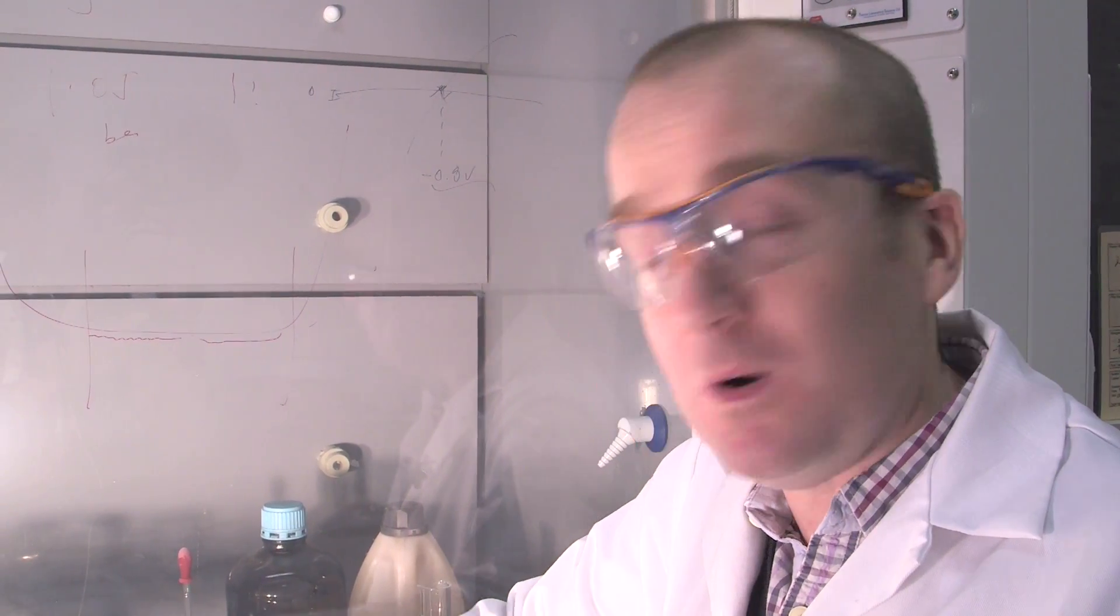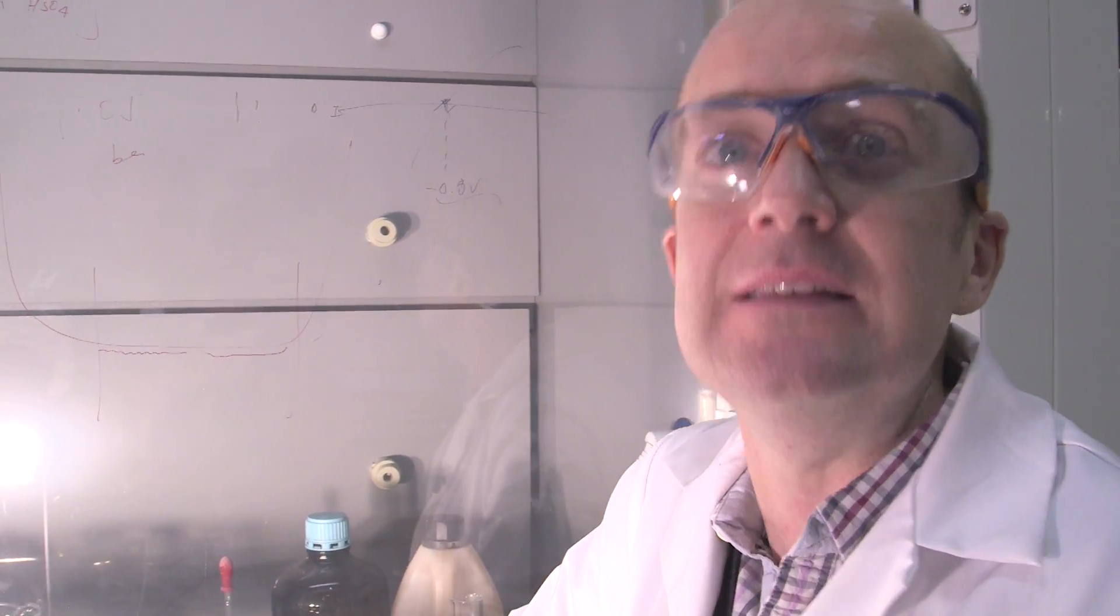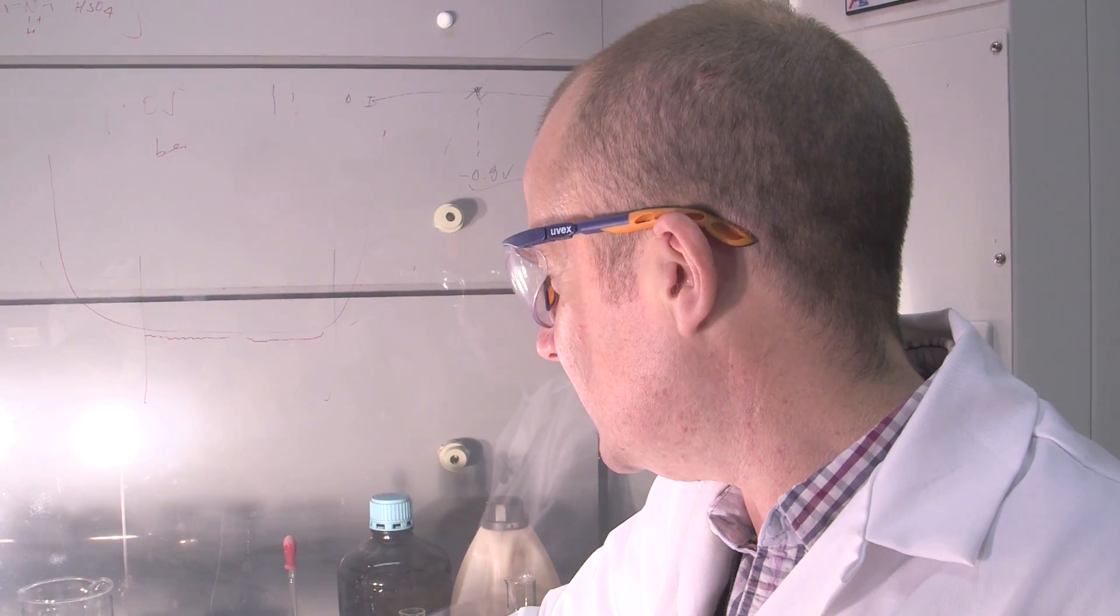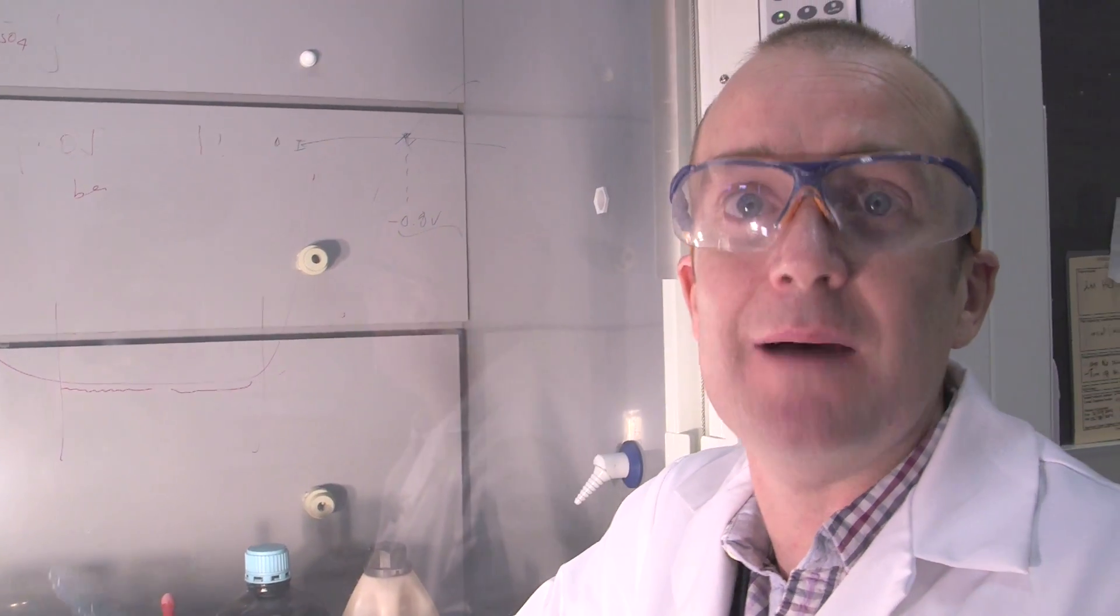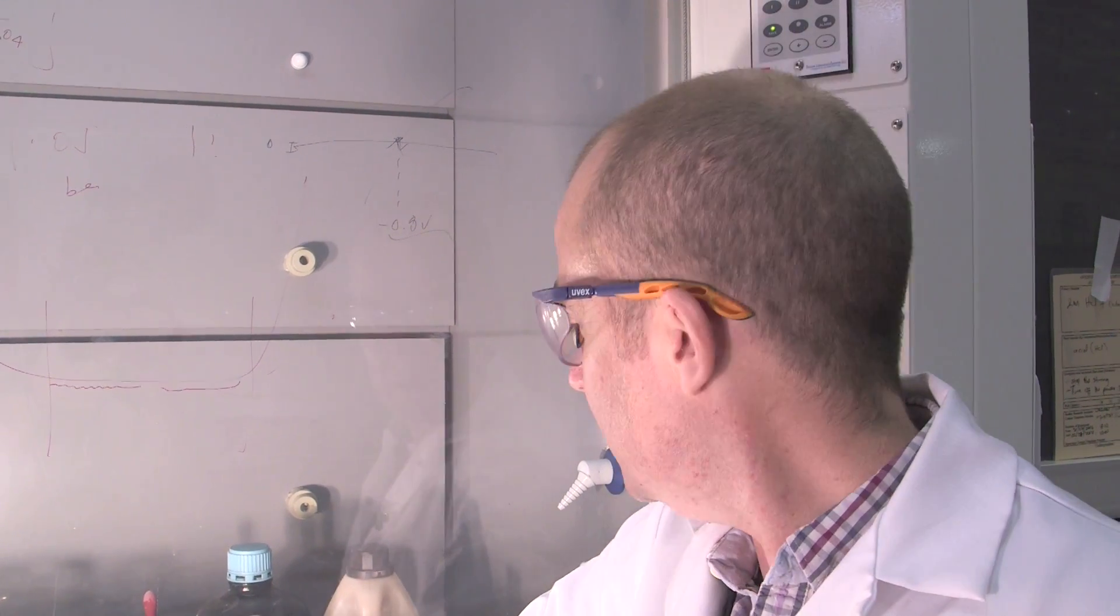We're going to leave this for a while, just so we have a nice intimate mixture between the phenol and the formaldehyde. And that'll sit there happily and nothing will happen until we add this, which is concentrated hydrochloric acid.